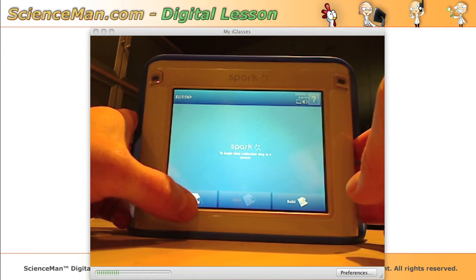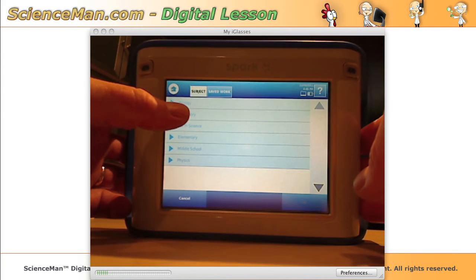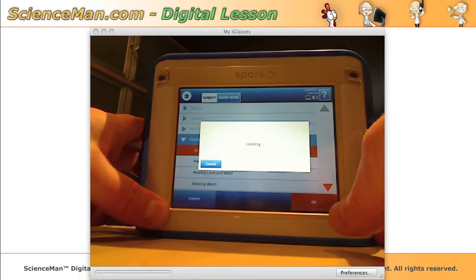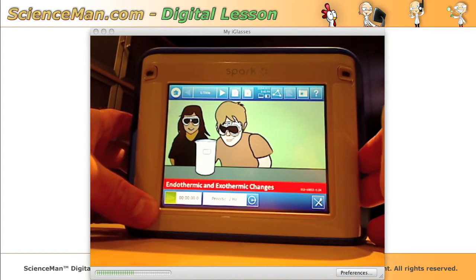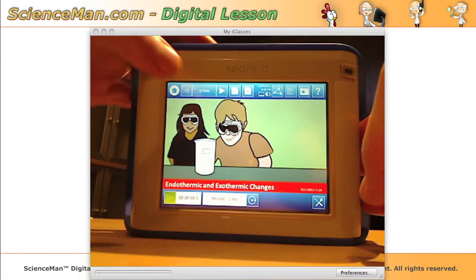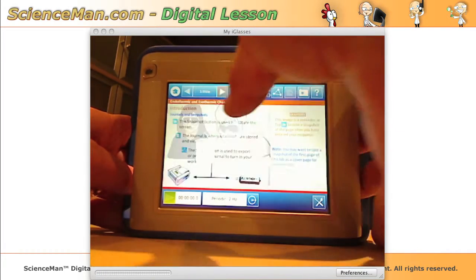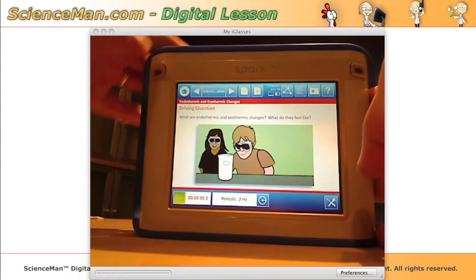Shipping with the SPARK is also a great experiment library. If you click open, you'll be presented with a list of biology, chemistry, earth science, elementary, middle school, and physics. If we open elementary and select 'Endothermic and Exothermic Changes' and click OK, we load up that experiment and see a whole lab with graphics beautifully set up — and that's built right into the SPARK system. All the student has to do is click through the page titles to move forward.